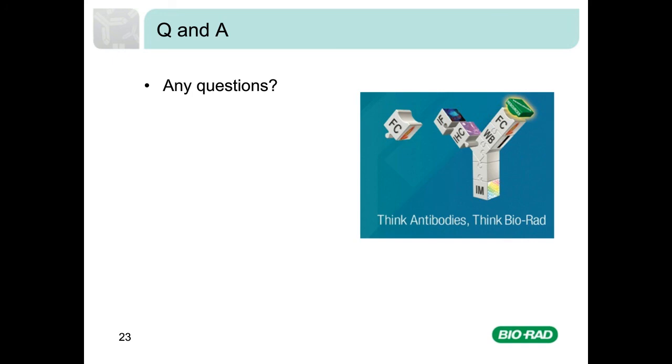A question here on titration. Despite titrating my antibodies and carefully setting up the compensation controls for them, I still sometimes see cells that appear to be double positive for unexpected markers. Are these real? Well, there's two steps to eliminating false double positives that you need to check before you investigate this any further. The first thing is to ensure that you have adequate FC receptor blocking in your assay, because the non-specific binding of antibodies can lead to false positives. So I suggest you try using an isotype matched non-specific control antibody to check this. And the other thing is to make sure you've gated out any cell doublets from your analysis, as you might find that your double positive cells may in fact be two single positive cells stuck together. You can visit our website for tips on doublet gating.